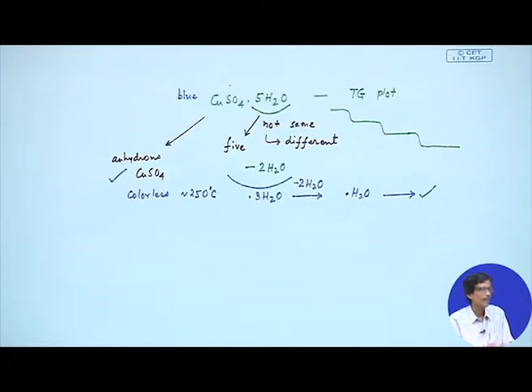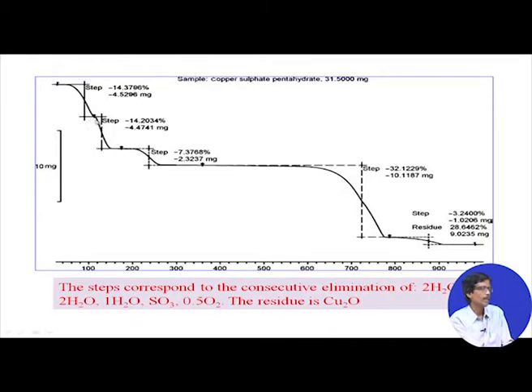So, what we see now is the stability of this anhydrous copper sulphate, which is not so easy to get, because in most other cases like anhydrous calcium oxalate or anhydrous magnesium oxalate, most of the time we get the anhydrous one around 140 or 150 degrees centigrade. But here we have to reach around 180 degrees to lose 4 water molecules, and to get the typically anhydrous one we must go above 260 degrees centigrade. Only above 260 degrees centigrade do we get the anhydrous copper sulphate sample, and it is pretty stable from this temperature to about 600 degrees centigrade.